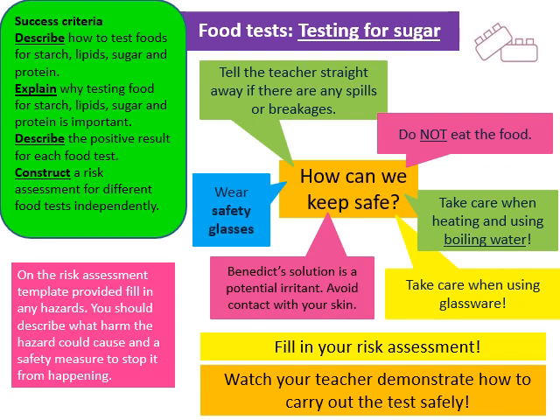Again, I've given you a list of some of the things to think about. So for example, in this one, we've got the added concern about the boiling water. So we need to make sure that we're careful with how we heat it, what we're doing with it, make sure that we are safe. We've also got slightly different chemicals that we need to consider and their potential hazards.